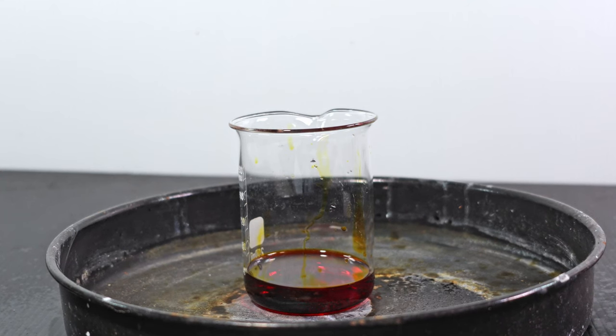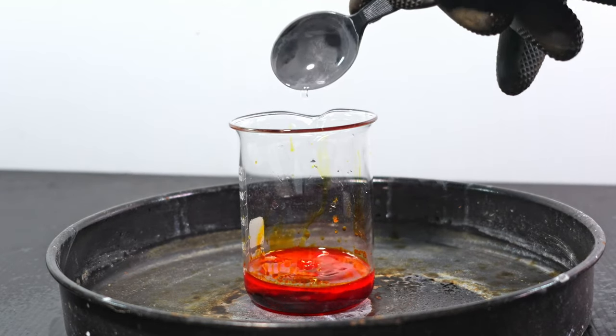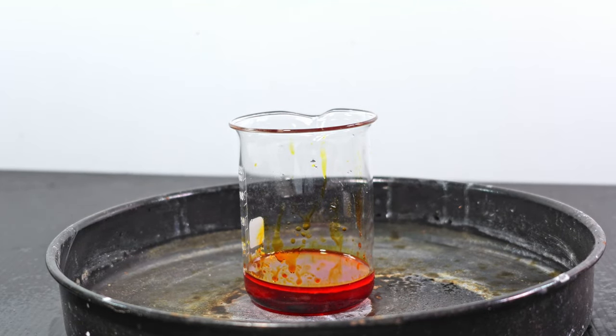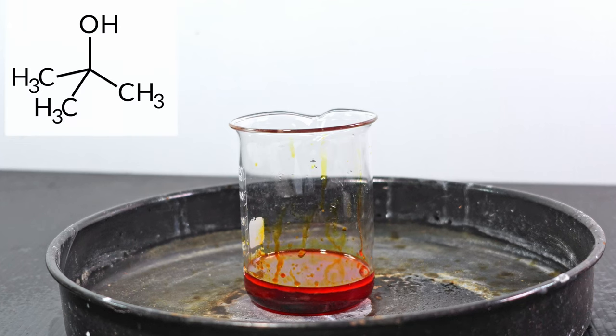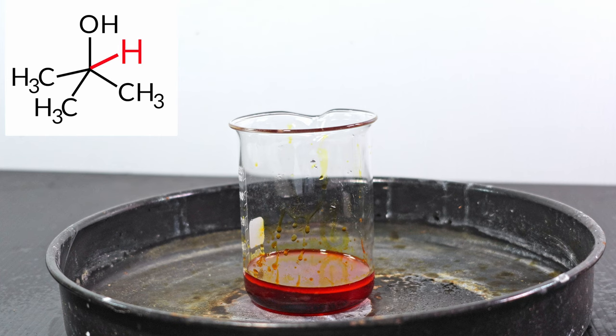For the third test, I am reacting chromic acid with tertbutanol. As you can see, nothing really happened other than a brief red flash. This is because tertbutanol is a tertiary alcohol, meaning the hydroxyl group is bonded to a carbon with three methyl groups. Chromic acid cannot oxidize into a ketone or carboxylic acid because there are no hydrogens on the functional group.